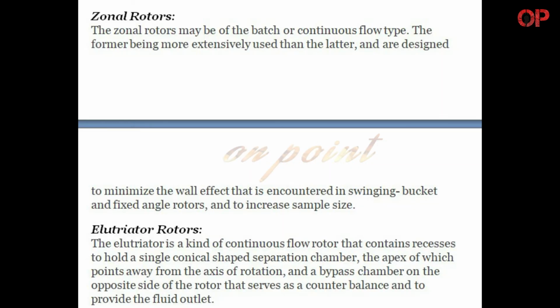Zonal rotors. The zonal rotors may be of the batch or continuous flow type. The former being more extensively used than the latter, and are designed to minimize the wall effect that is encountered in swinging bucket and fixed angle rotors, and to increase sample size. Elutriator rotors.